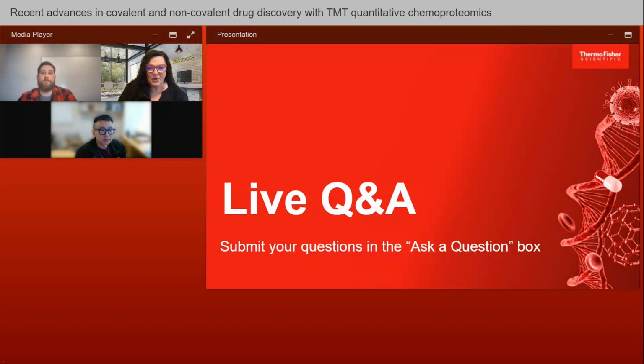All right. And then our second part: why is it so much more successful to measure the competition ratio and decrease of peptides and not detect an increase of ligand-bound peptide? It's much easier to do that because you know the modification, which is the DBIA probe. When you do the competition assay, we're measuring that reduction in signal.